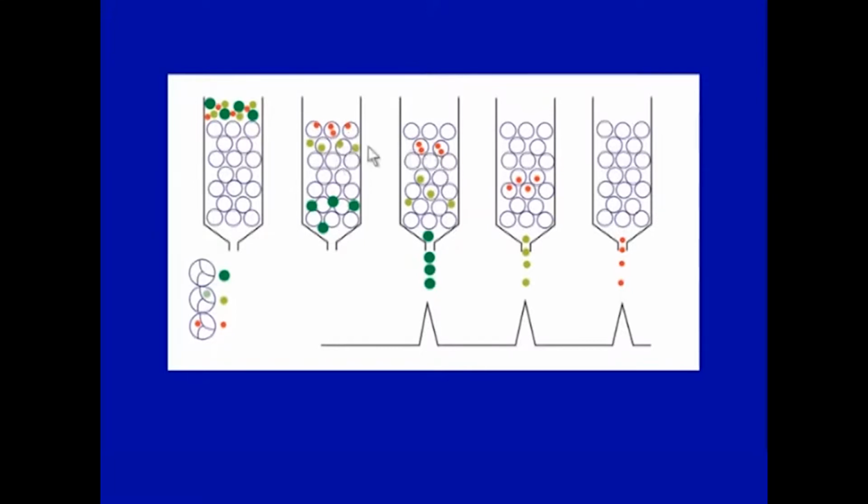As the column runs and time passes, the first to elute is the larger one and you get a separate fraction. You can see how the peak resolution can take place if their molecular sizes are far apart, and they could be easily separated into different fractions and utilized for different applications as a purified product.